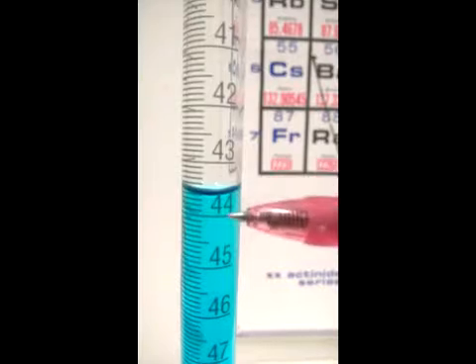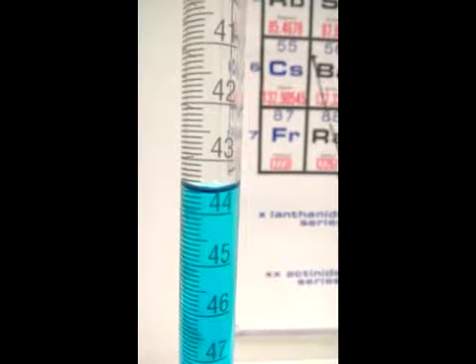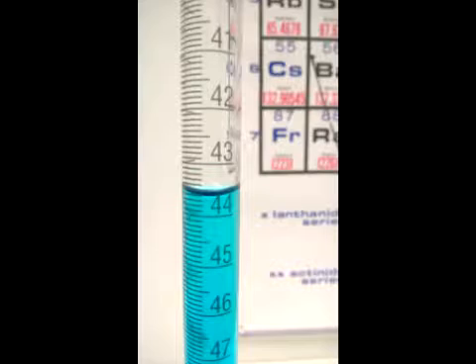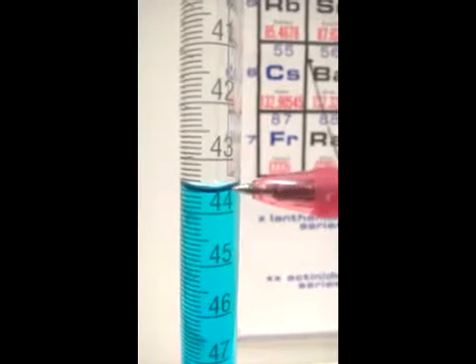Between 43 and 44 there are 10 unlabeled marks. Therefore, each mark is equal to 0.1 milliliter.